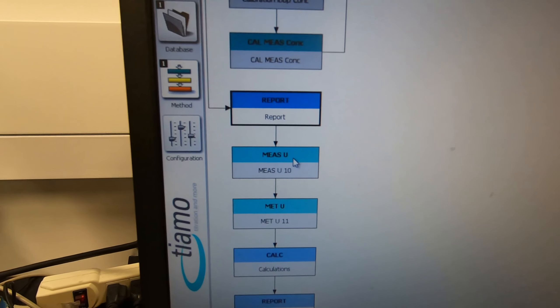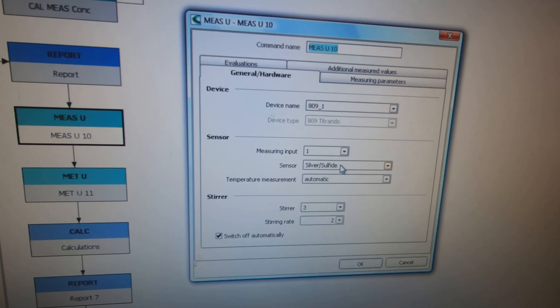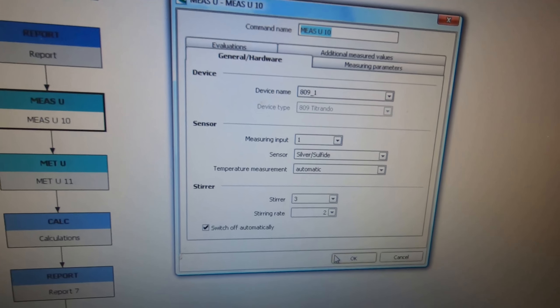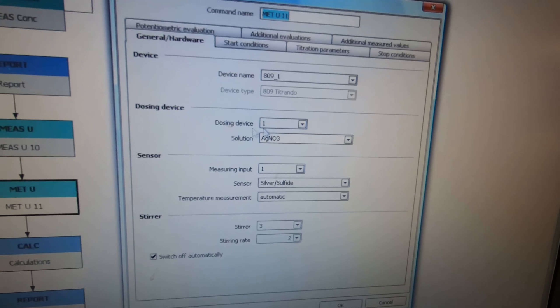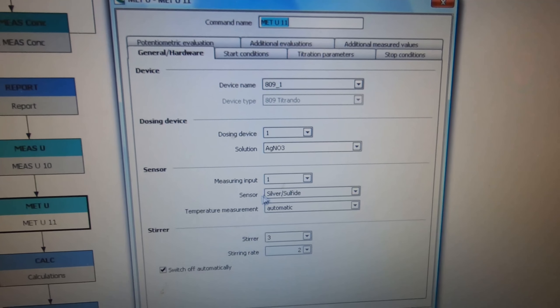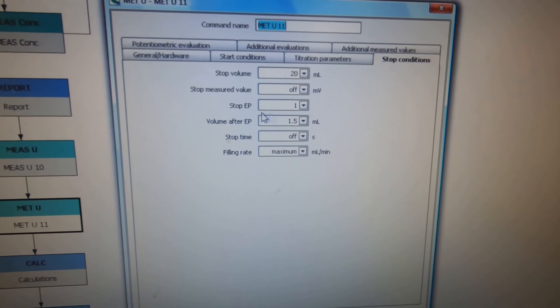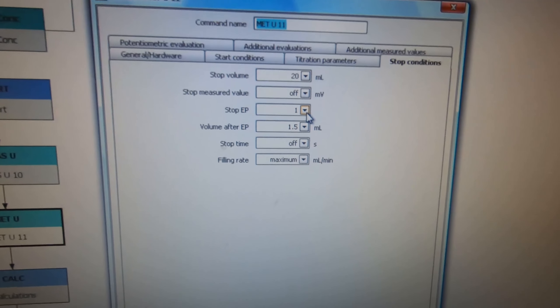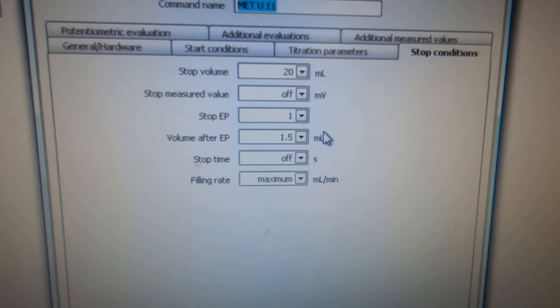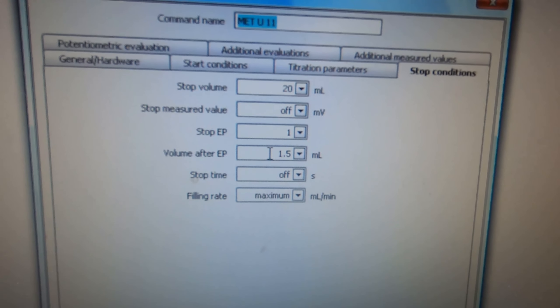Moving on to the titration - to start titrating here. Again make sure the silver sulfide electrode is chosen. In this tab you can check that the solution is silver nitrate and the sensor is the silver sulfide electrode. At the top, make sure you chose one end point and 1.5 ml means after reaching the end point it will still run additionally.